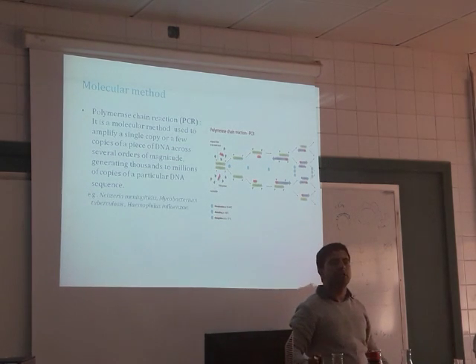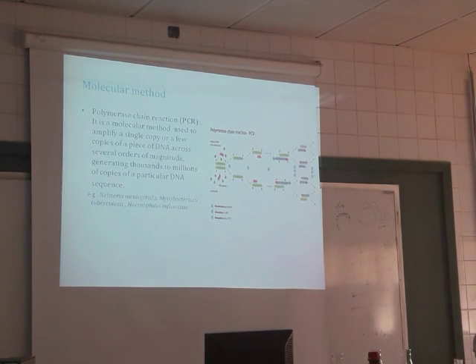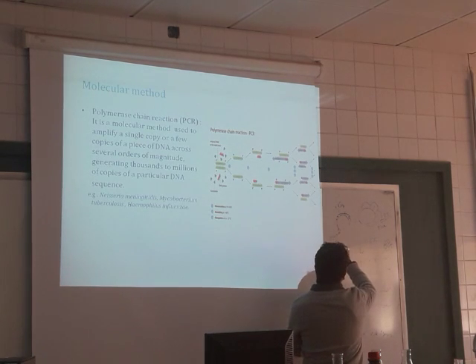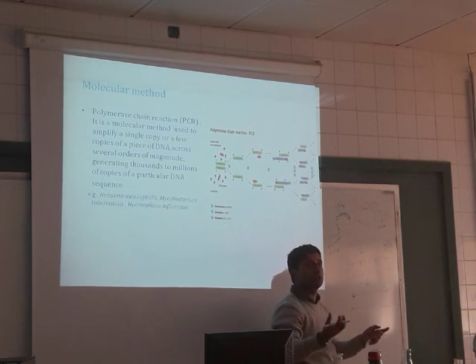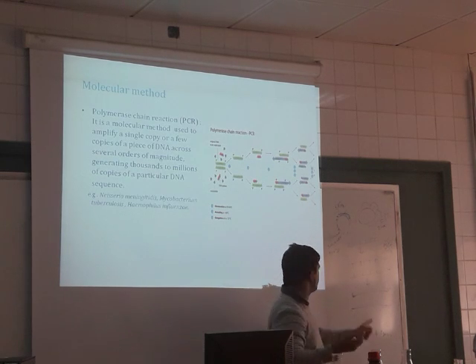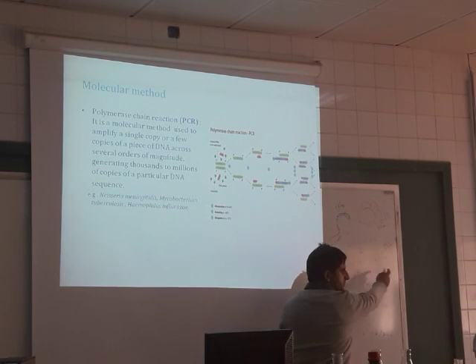I will explain why we need the primer in PCR. For example, if I have to put the switches on, what do I need? I need support. So in the beginning, I told you in the PCR we need primer, nucleotides, and DNA polymerase. When we separate these 2 strands, we have the nucleotides, adenine, guanine, cytosine. But how do we bring them here to attach? For that we need the support, the primer. Primer fixes here. This is DNA separated by heat.